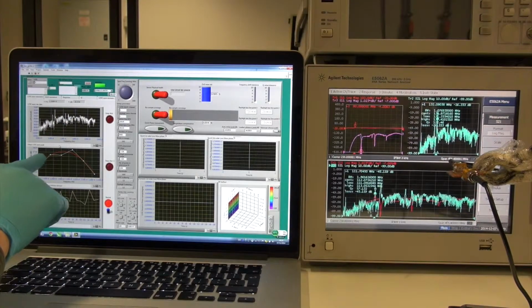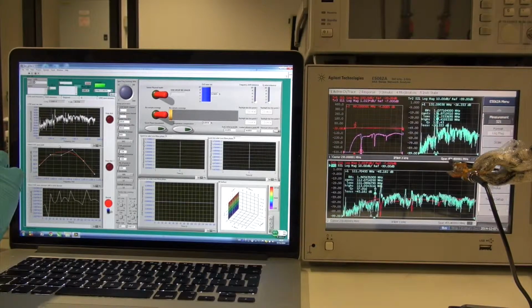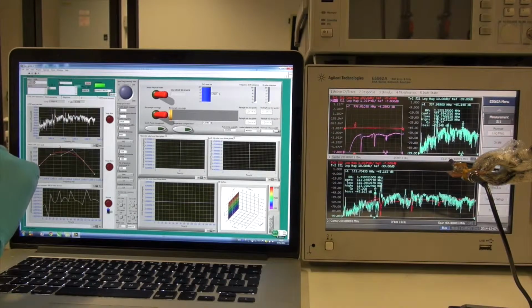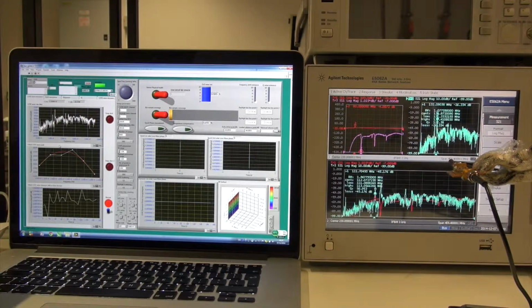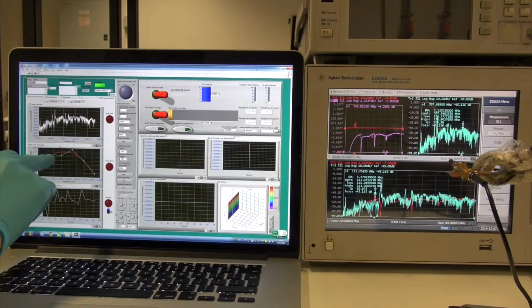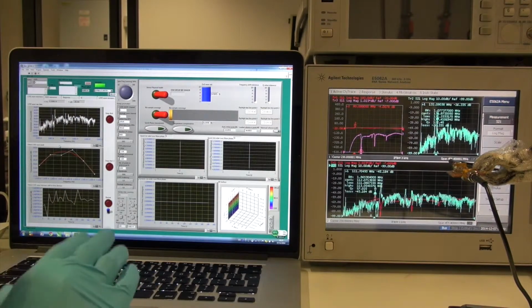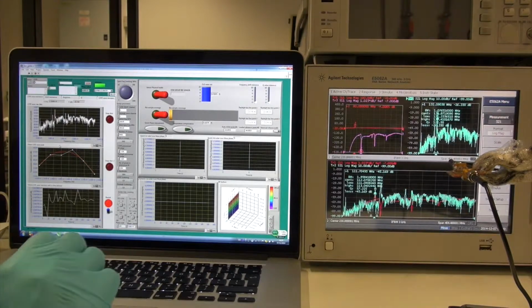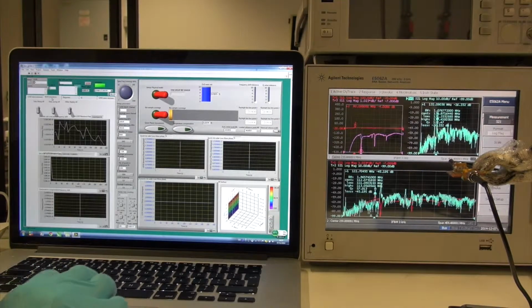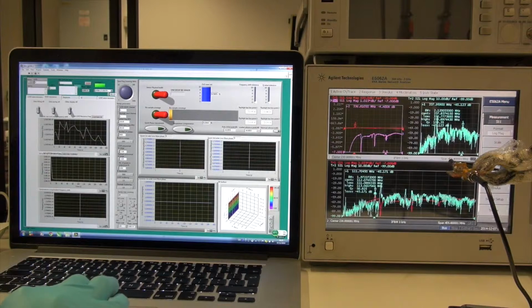The benefit from this is if there's any sudden signal change, like some radio frequency signal interference, or if some dust suddenly attaches onto the surface, which is not the signal we need to measure, then if there's some weird change in the data samples, it will automatically average it and keep the resonance peak stable, and give a more trustable analysis.